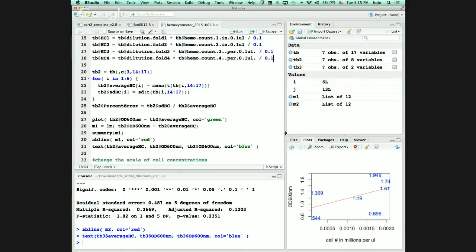When I put it through, it's on extract here. That's fine. So you have to go to the comment sign in the comment. That's correct. Highlight is actually wrong.